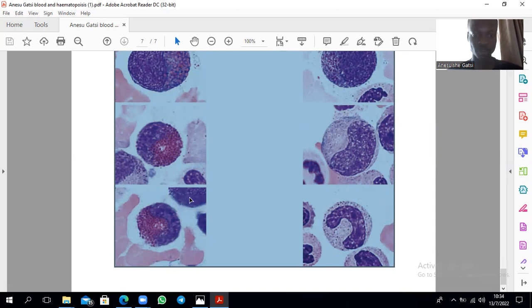You can have an eosinophilic band cell, you can have a neutrophilic band cell. And they exhibit a horseshoe-shaped nucleus, which can be extruded into the blood to fight acute infections and everything. And they may be produced without that bilobed appearance of the nuclei, right? For example, here, that's a band cell right over there.